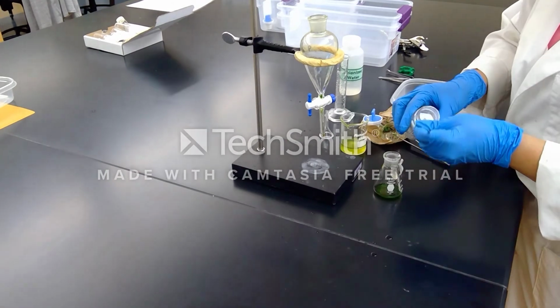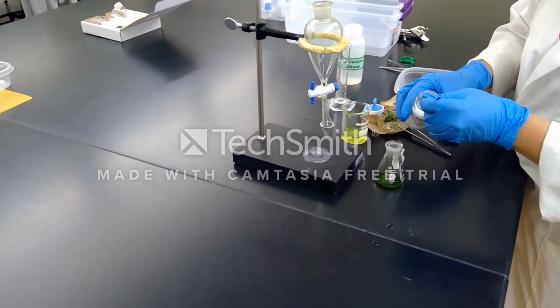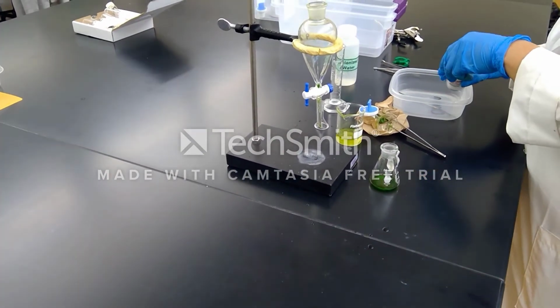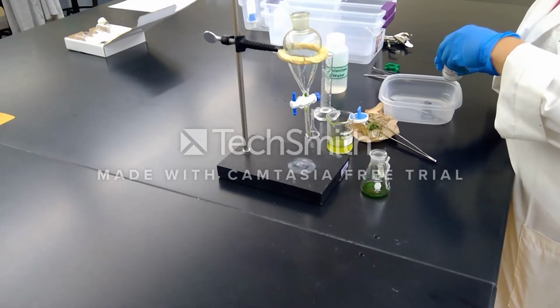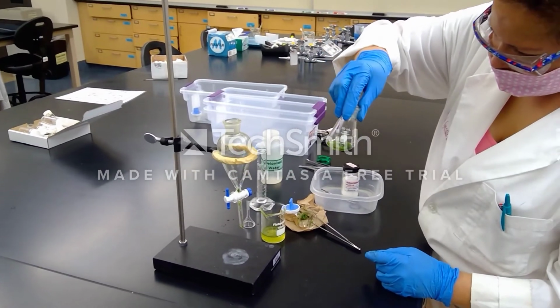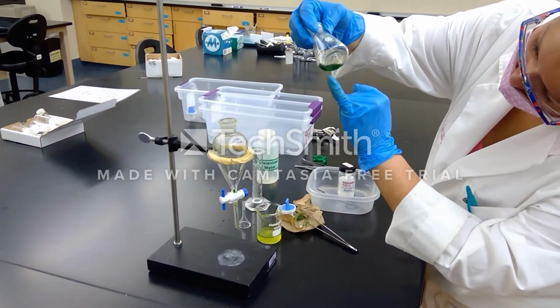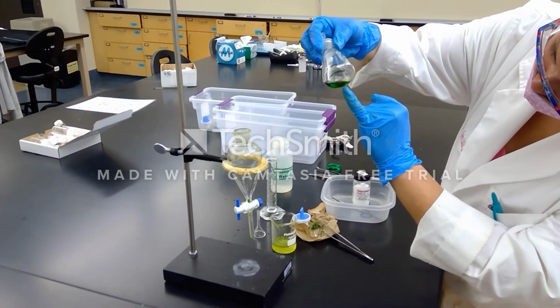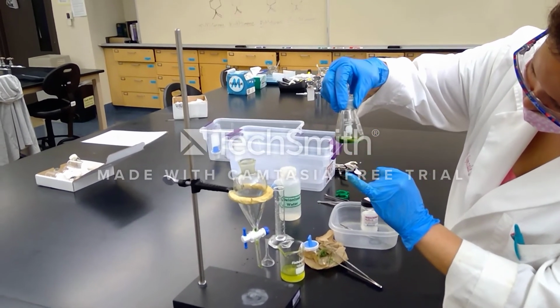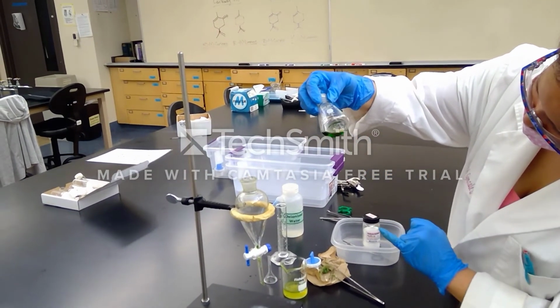to dry out our solution. And this is in case there's any water droplets in the liquid that I have collected in the upper layer. This just ensures that we have no water in the liquid that we are trying to isolate from the spinach. And I'm searching for water bubbles, but I don't see any. What we would see down here is some very yellow globs if we did have any water in here. And it looks like we don't. I just see the salt and the nice dark green.